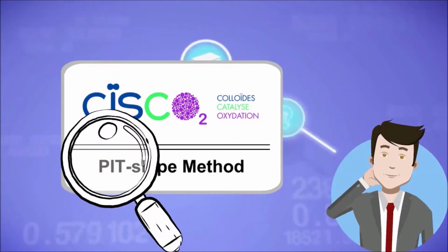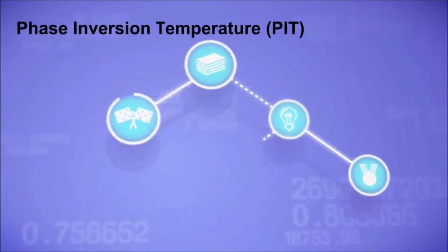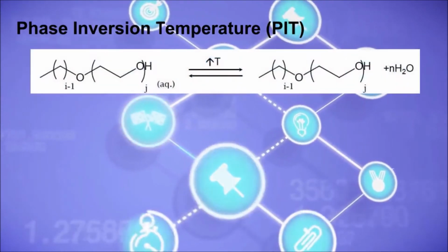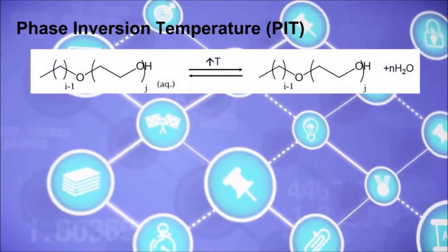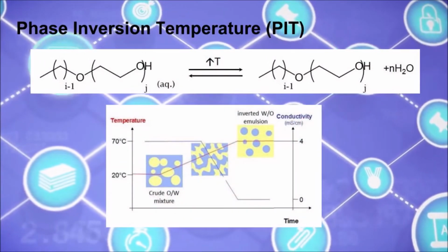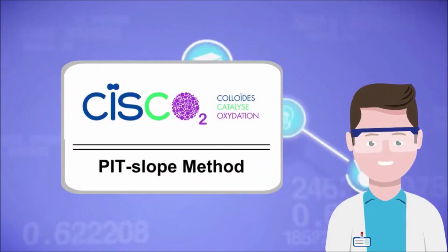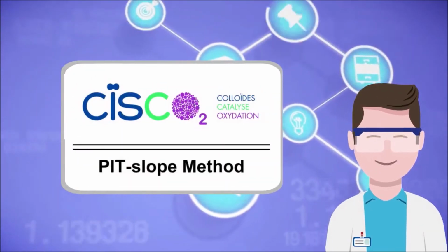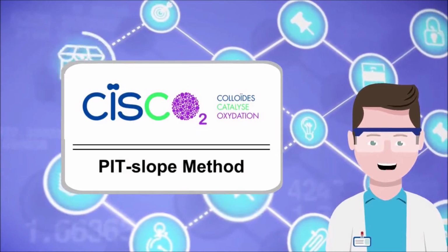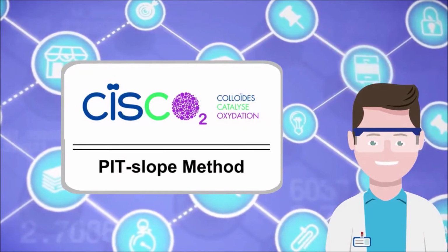What is the phase inversion temperature? The phase inversion temperature corresponds to the temperature at which the hydrophilic-lipophilic character of an ethoxylated nonionic surfactant switches, by the dehydration of the polyoxyethylene units during heating, leading to the emulsion phase inversion from oil in water to water in oil. The PIT slope method is based on the gradual addition of a second surfactant into a reference system and then determining the change in the phase inversion temperature.